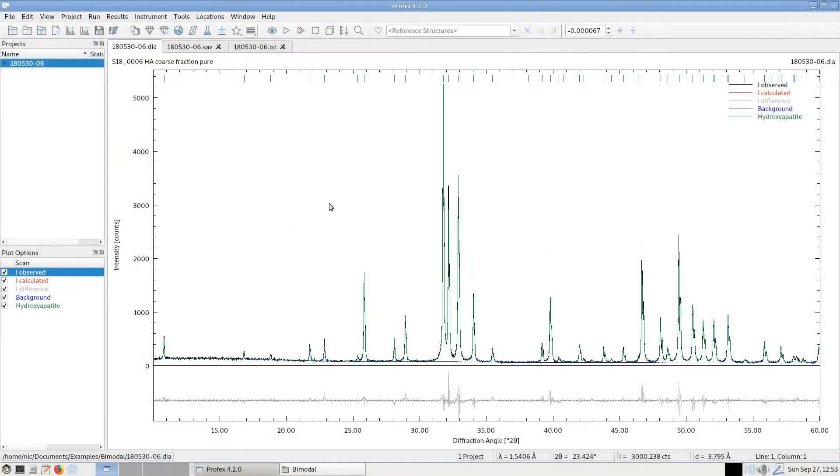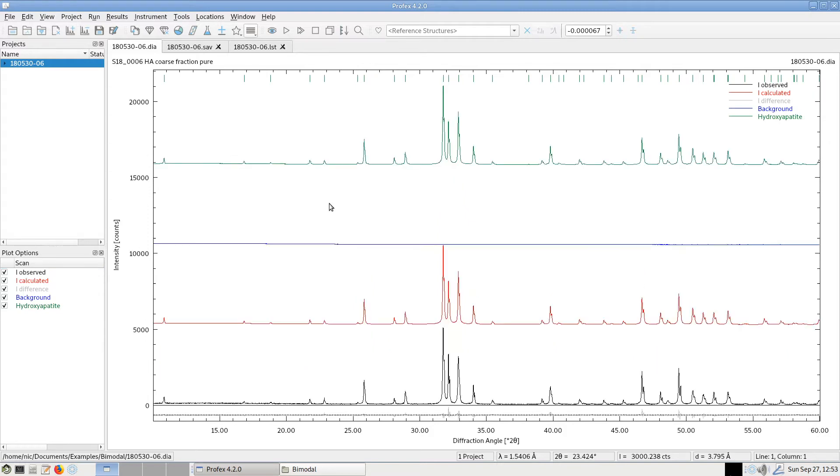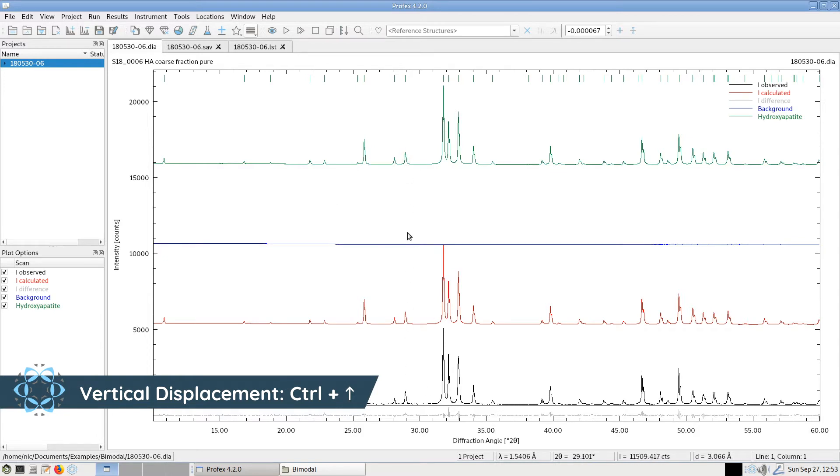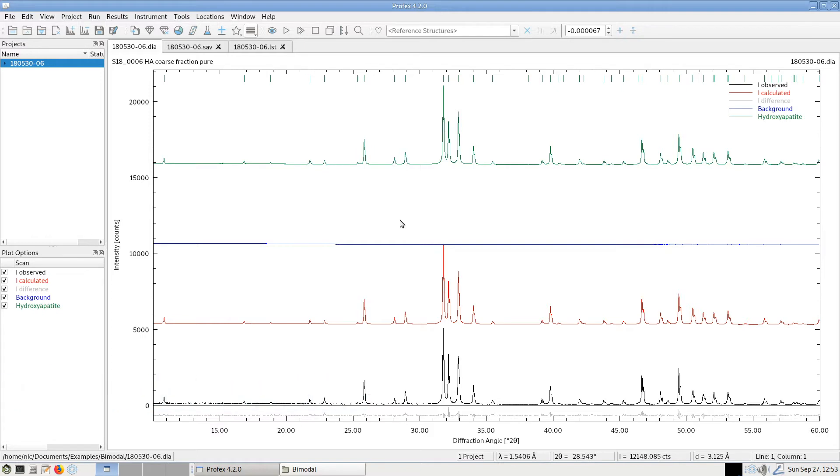There are some more actions using keyboard commands. For example, we can stack scans vertically by holding the Ctrl key and using the arrow key up. This will stack all scans with the same vertical displacement. And to reset it, to go back to unstacked scan, we can use Ctrl and the spacebar.